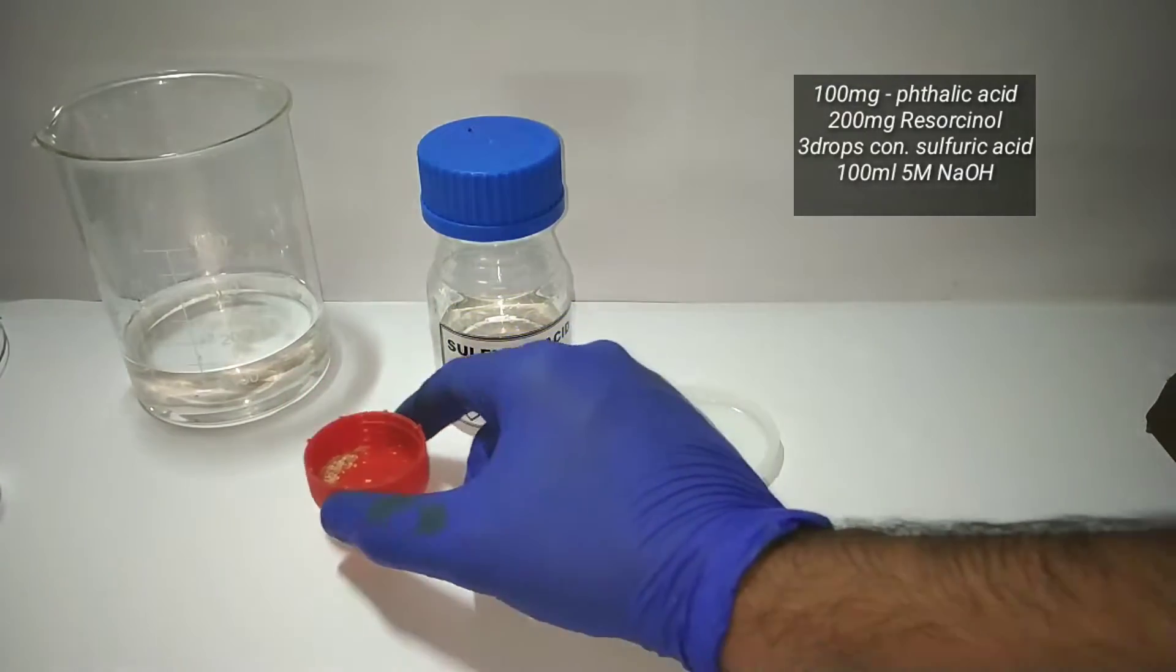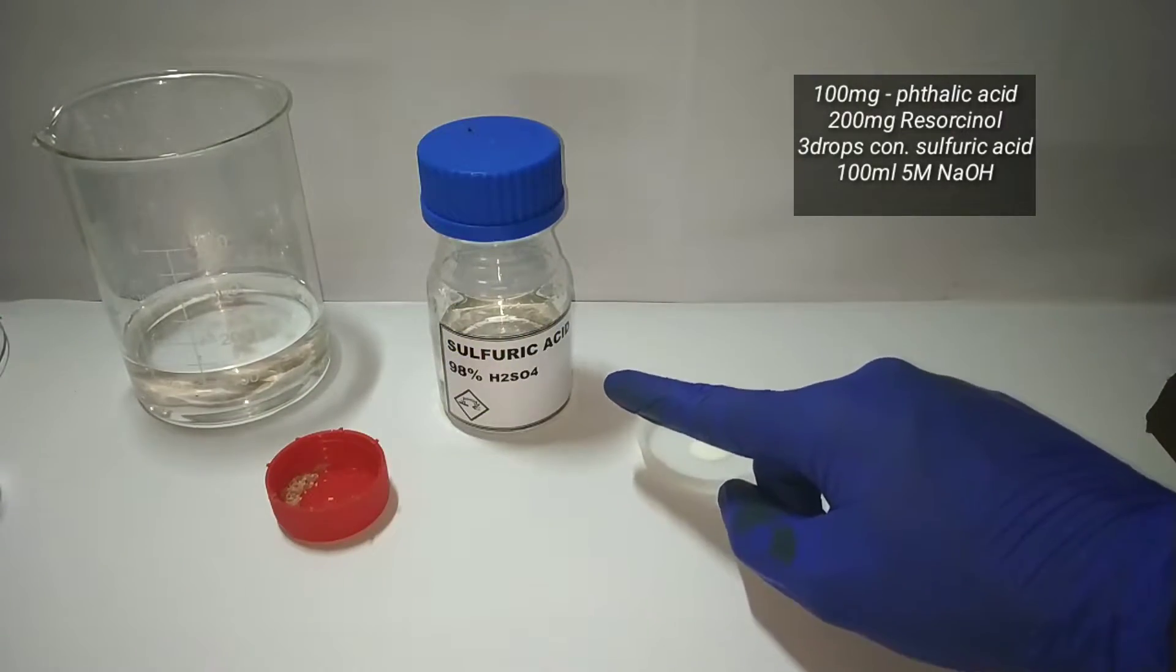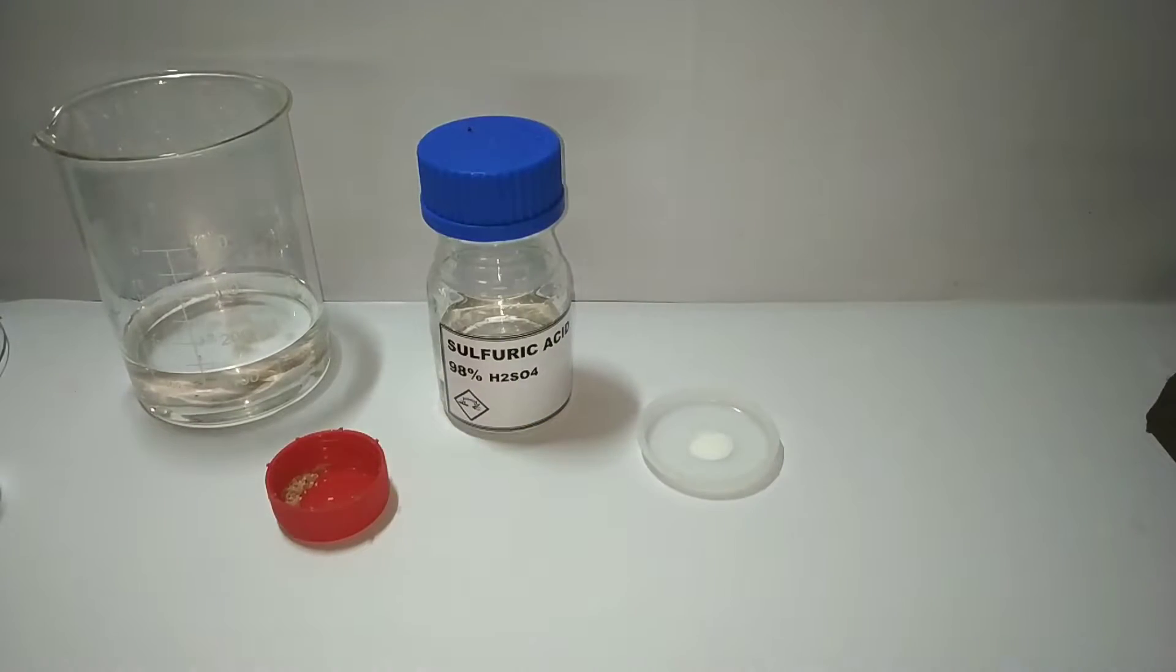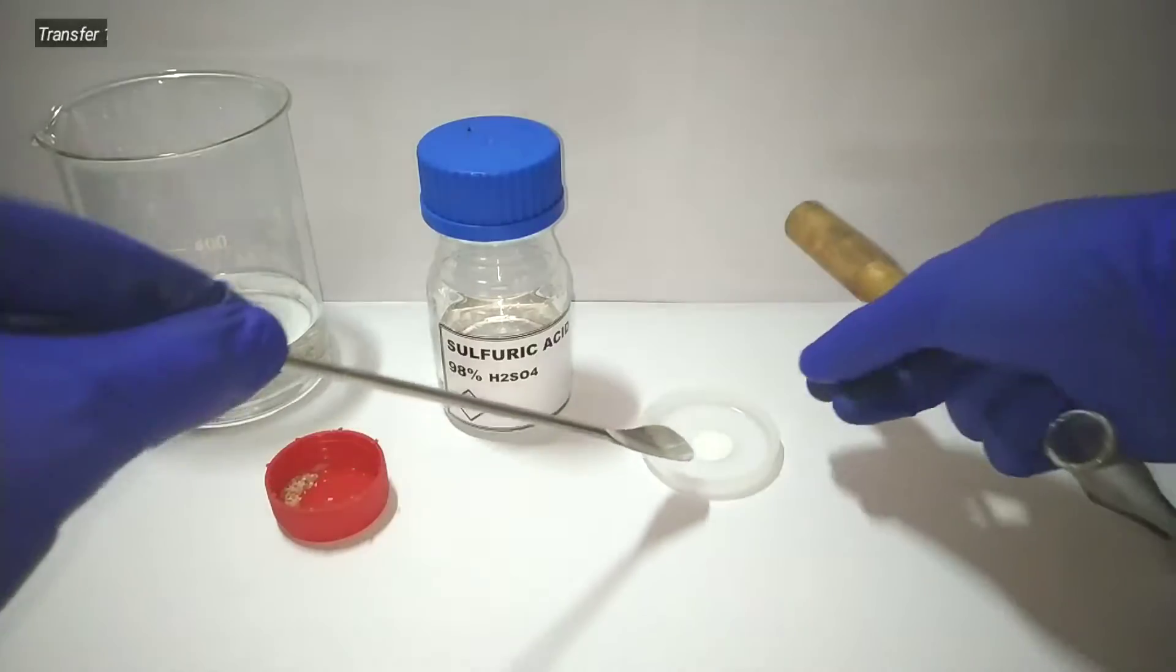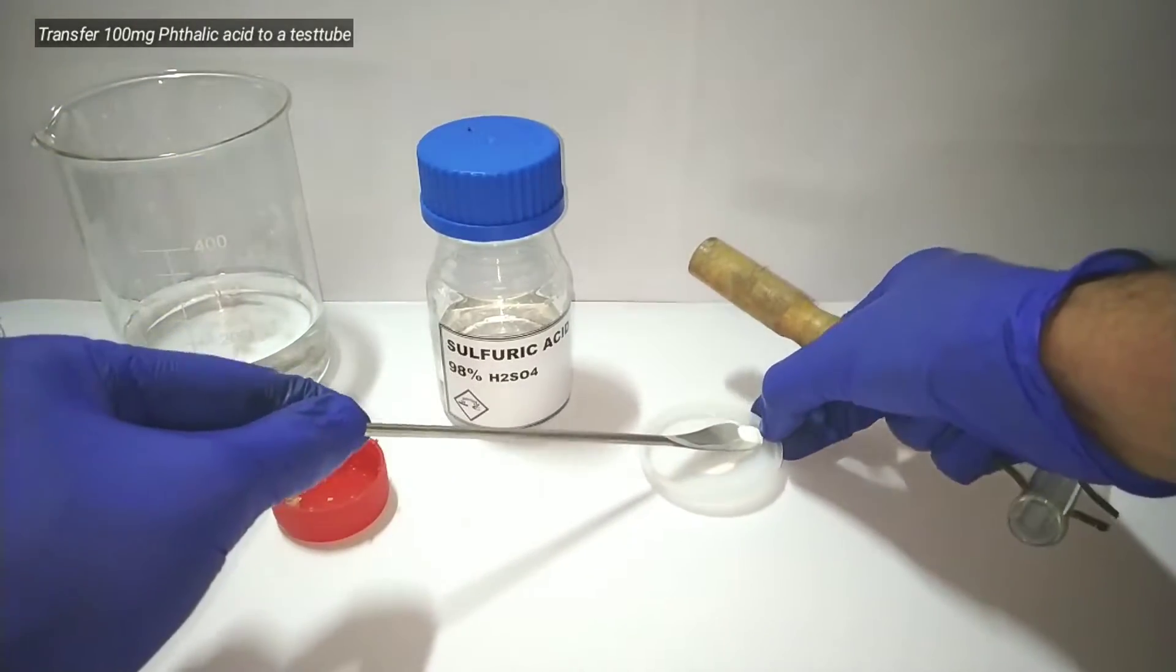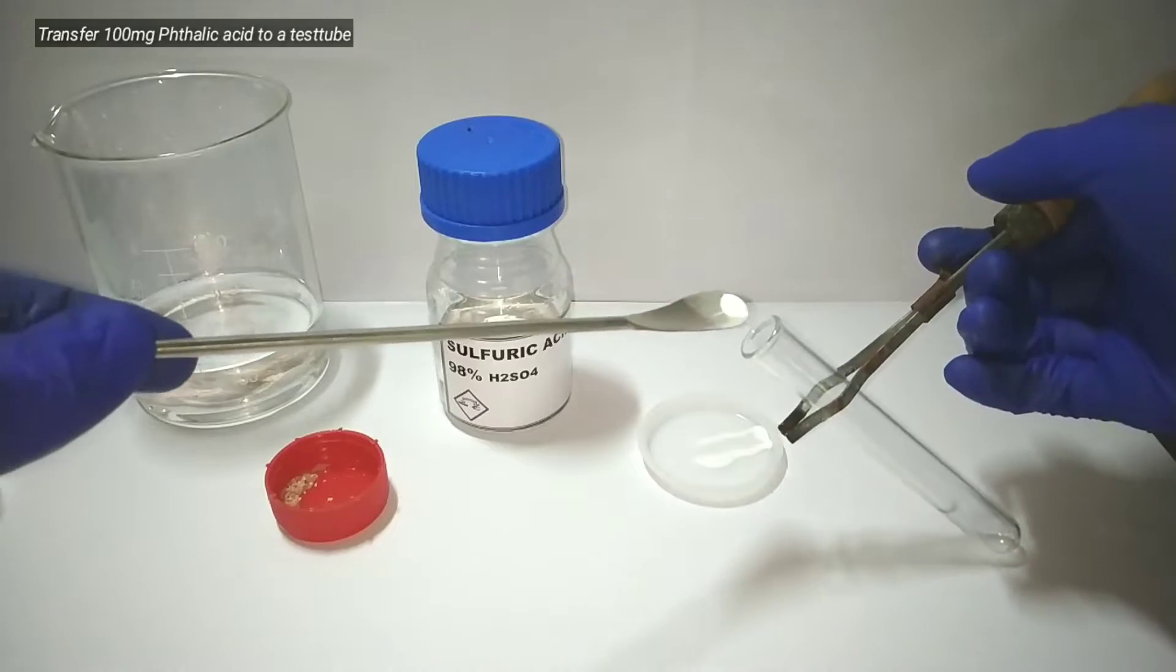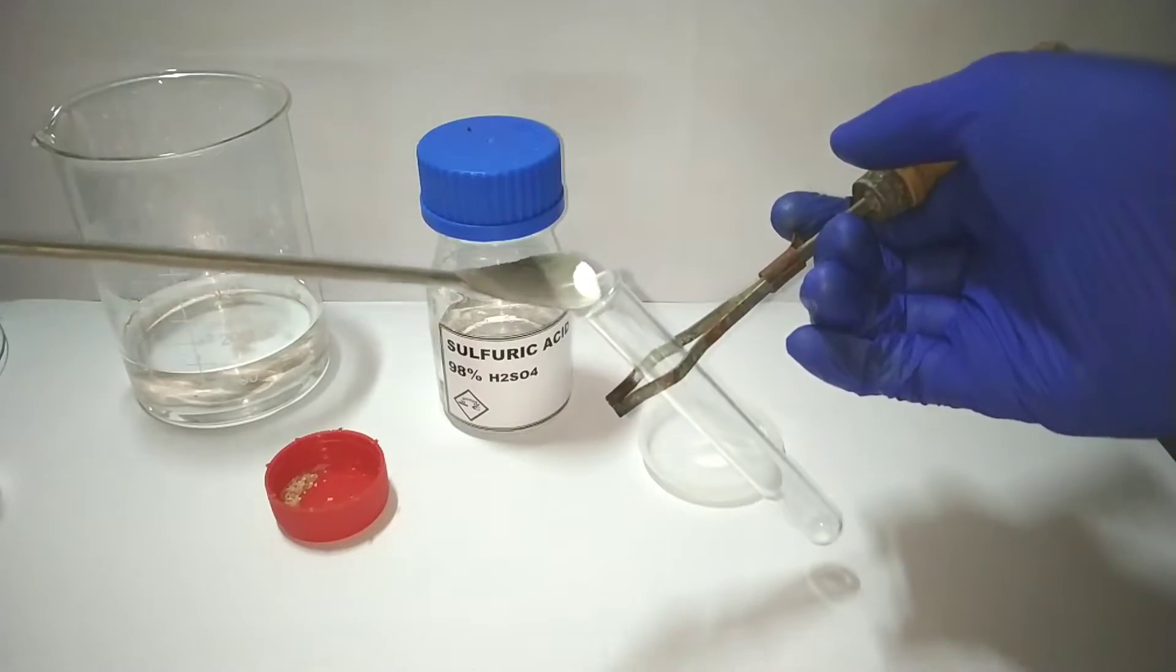We need 100 milligrams of phthalic acid, 200 milligrams of resorcinol, three drops of concentrated sulfuric acid, and 100 milliliters of 5 molar sodium hydroxide. We start by taking a clean and dry test tube and then add 100 milligrams of phthalic acid.